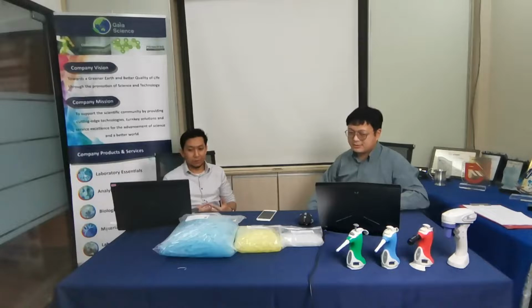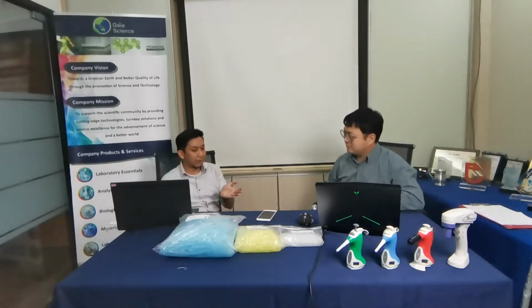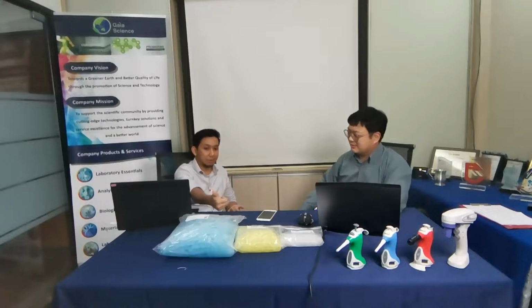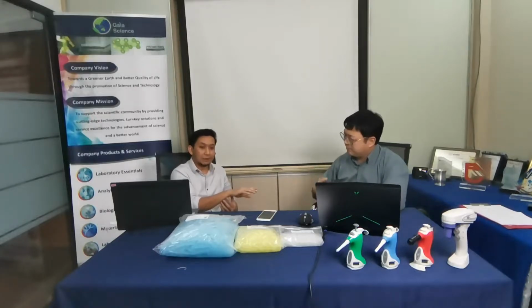Okay, so just to wrap up everything. The first question we had was about bulk. Technically you can say bulk is cheaper, but there are pros and cons you have to consider as well. Although bulk is cheaper, think about the time we spend repacking, and think about the sterility. When you purchase it packed, I think most products out there in the market are always sterile. Am I right? Yes, correct, because they're always packed together. Talking about sterility, you cannot simply take this out of the bulk bag and claim it as sterile.